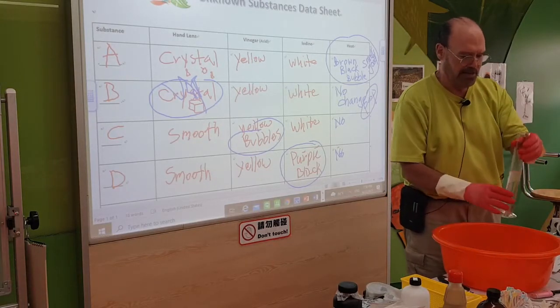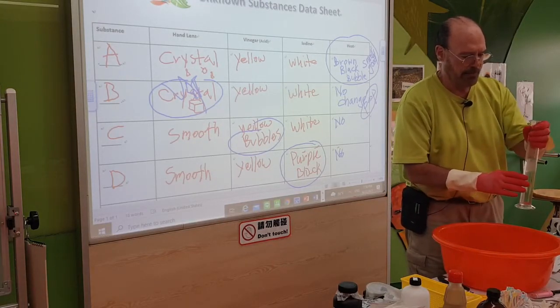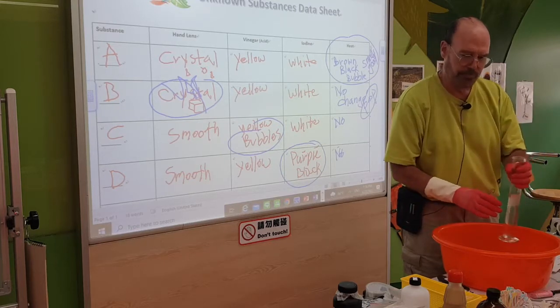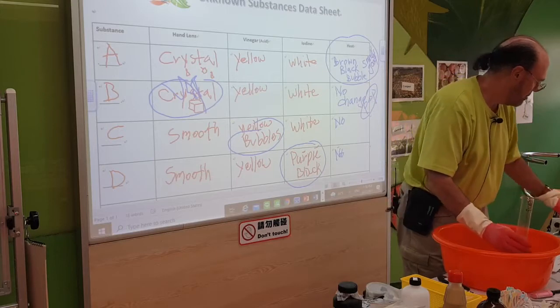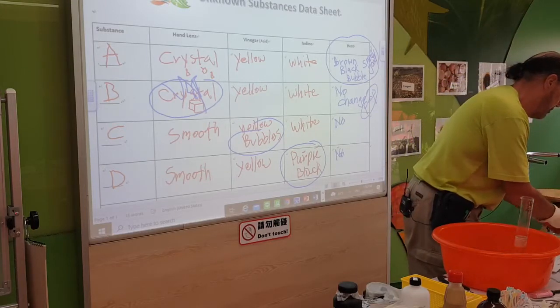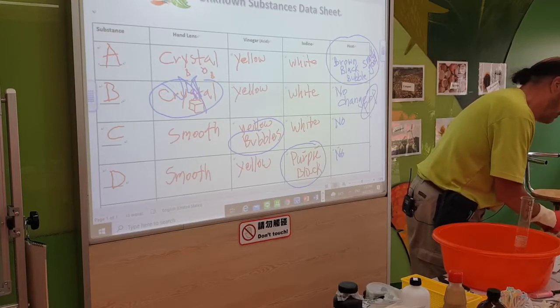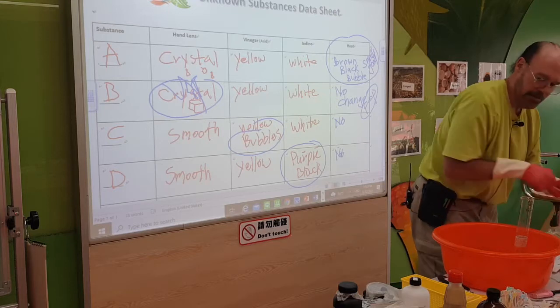So I kind of want to mix that a little bit. Let's see, there we go. Maybe I can.